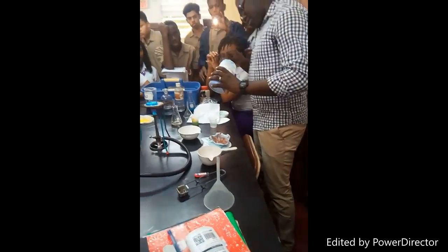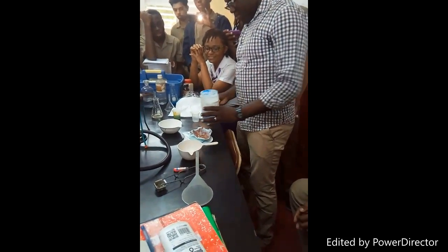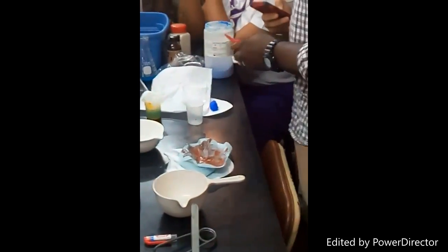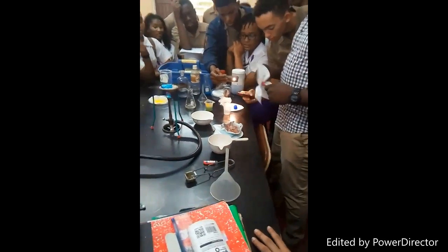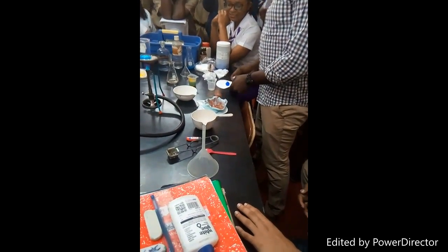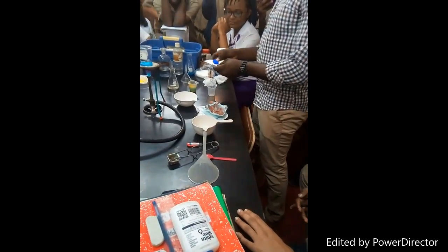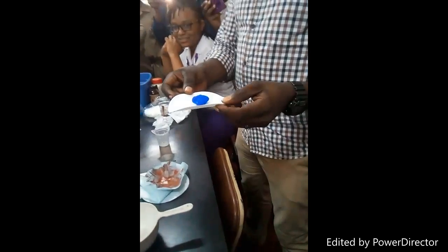Ideally, the substance that we're trying to make, we want it to look like that. Wait, sorry, so when you had it in the test tube yesterday, what were you doing? Wow. That's some lit stuff. So cool. It's so pretty. You can't see this on camera. This is what we want the substance to look like. Do you see this? It looks nice. It almost looks edible.